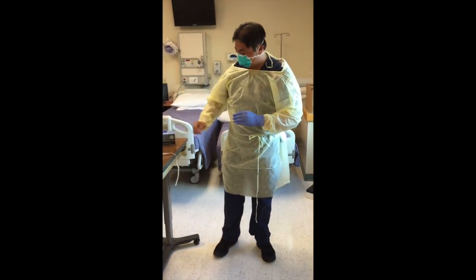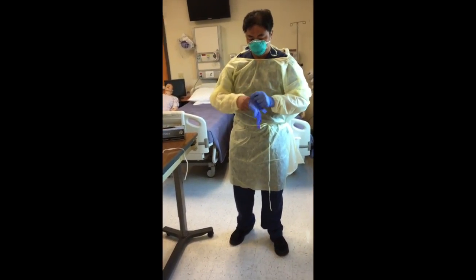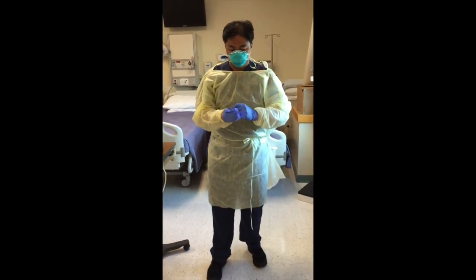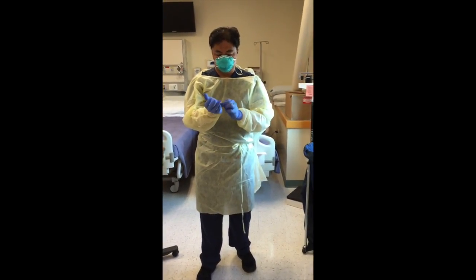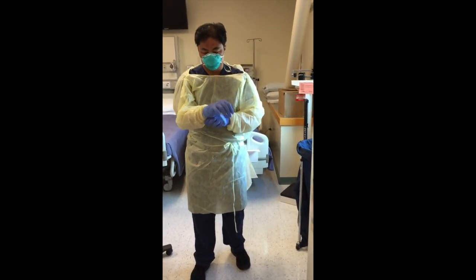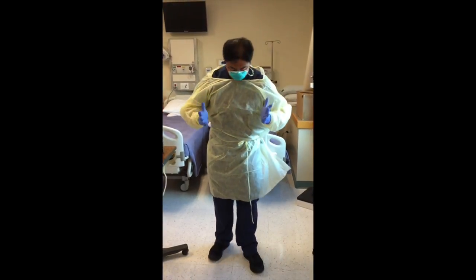So you just want to make sure you cover that part. Right, so now you have all your PPE on.